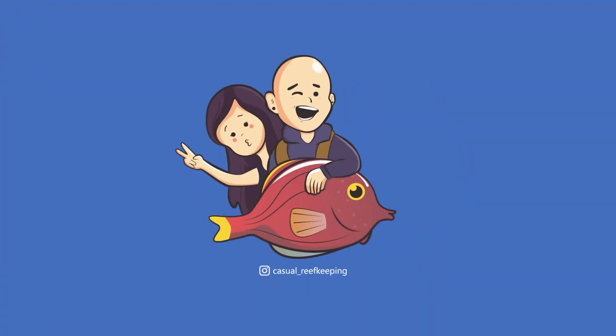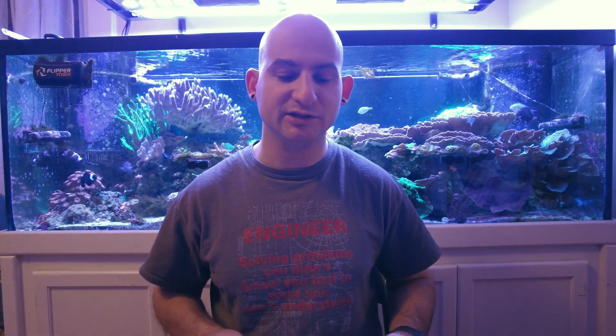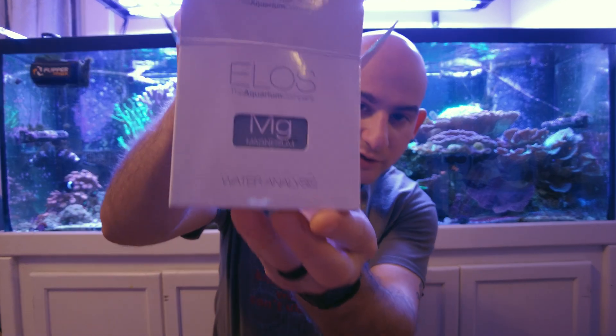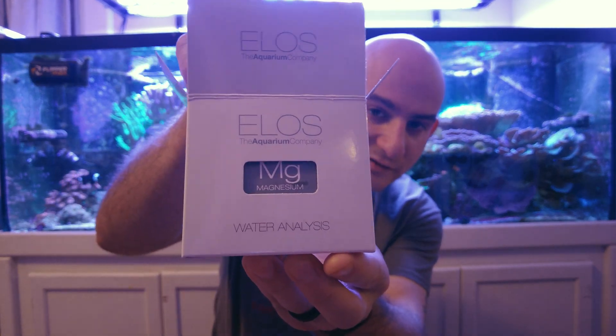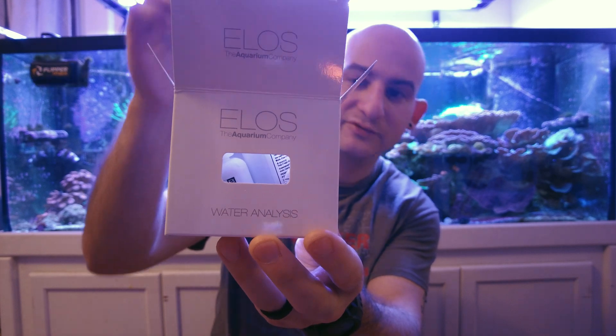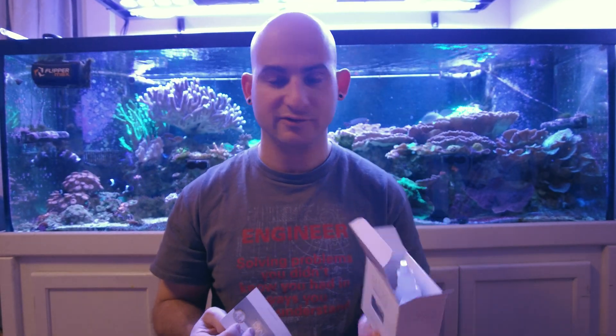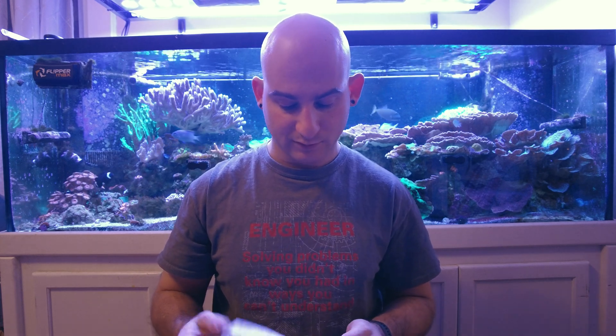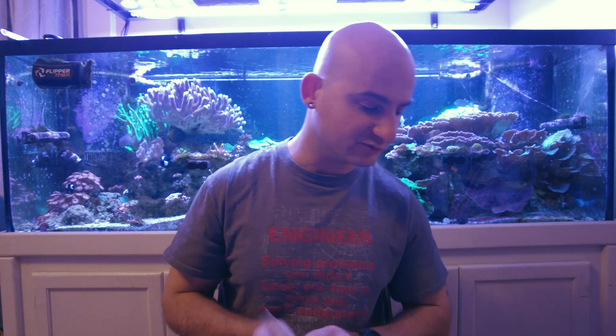Let's get started with the ELOS kit. Something neat I noticed when unpacking it is that the little logo where it tells you what the test kit is actually doubles as the instruction booklet when you pull it out. That's kind of clever packaging — they don't have to make separate boxes. It comes with a quick start guide, which is what I'm going to reference.